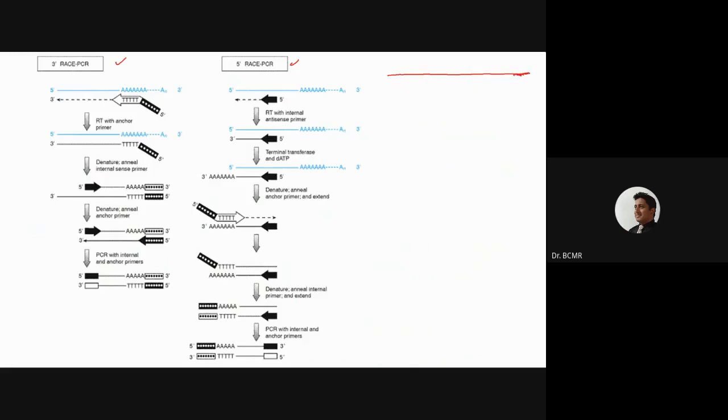You can think of it that way. So here, we will call this the 5' part and the 3' part of the gene or open reading frame. Okay, something like this. So the strategy is, if you can amplify this part, something like this, and amplify this one, say, using primer A and primer B, and if you can also amplify using primer C and primer D.